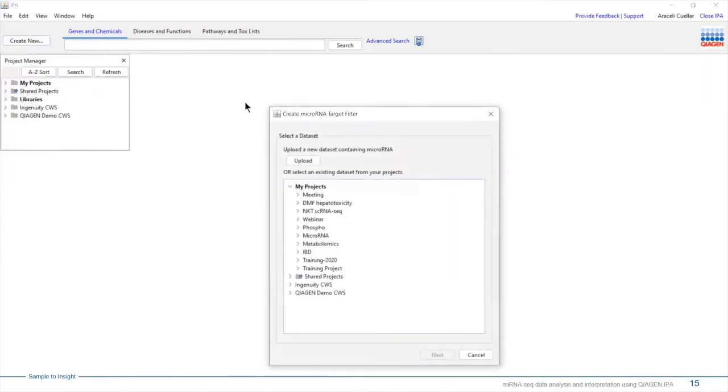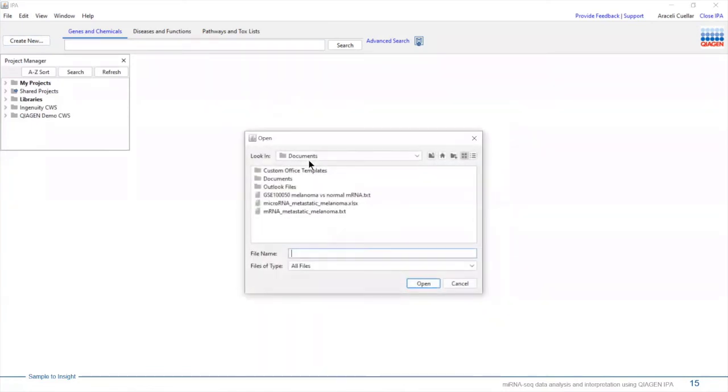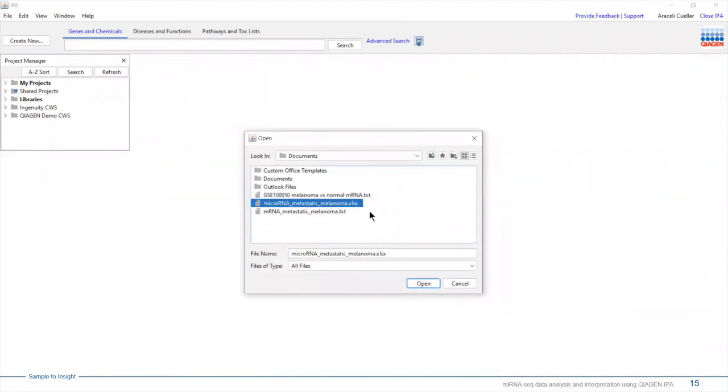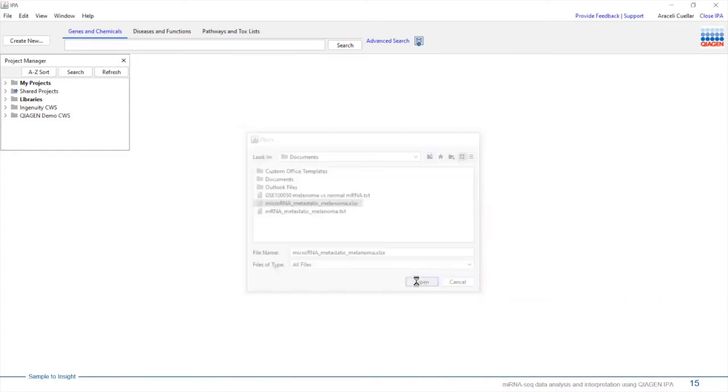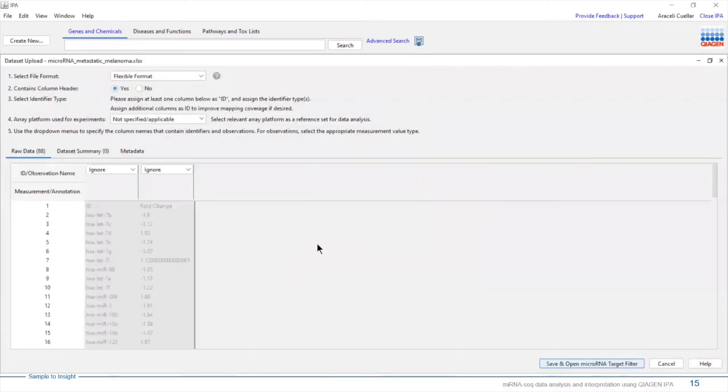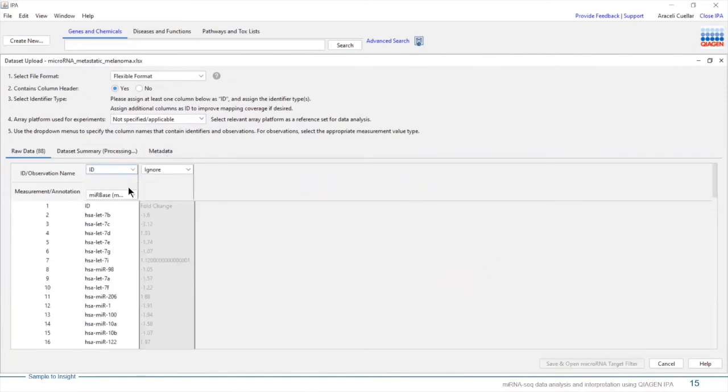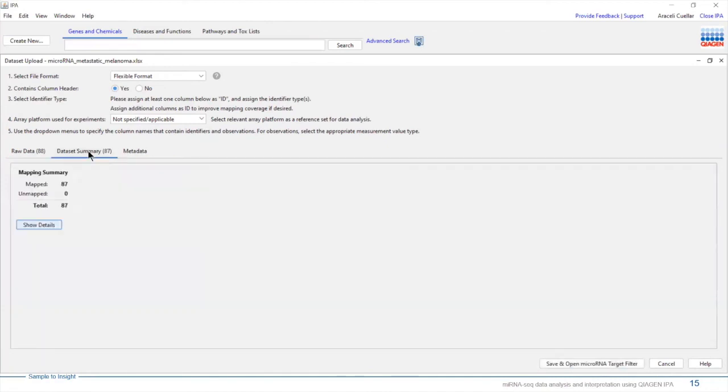Here, we're going to go ahead and upload our dataset. I'm going to select my microRNA dataset for metastatic melanoma. Once we're in the dataset upload manager page, I'm going to let IPA know that this is my ID column.